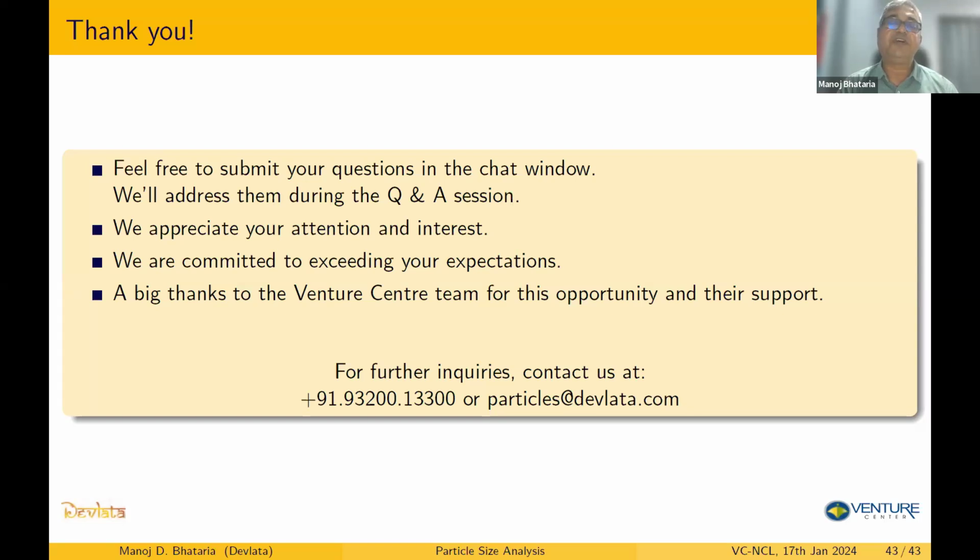Most of the instruments will have a chart of the liquids, and it will also have the chart of the viscosity of the solvent and the refractive index, because those two parameters go into the calculation of the DLS particle size. Internally the instrument will have a table of the viscosity and the refractive index of the liquid at different temperatures, because you have a very good temperature-controlled oven where you keep the sample cell.